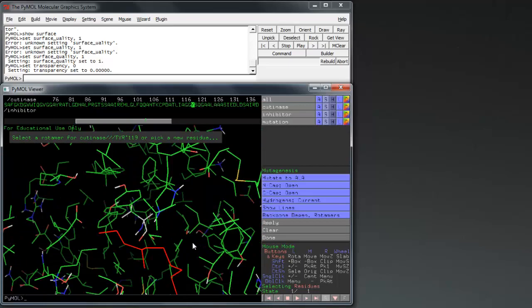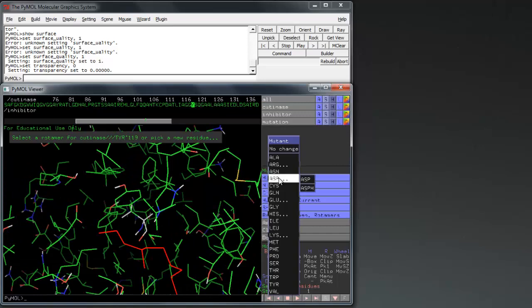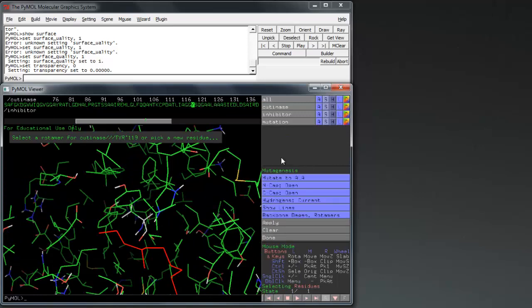At the right hand of the screen, select the amino acids you would like to mutate to, before pressing Apply, and then Done to close the menu.